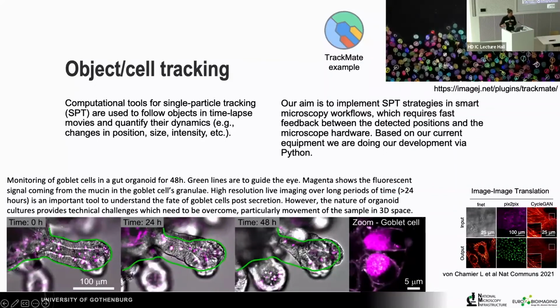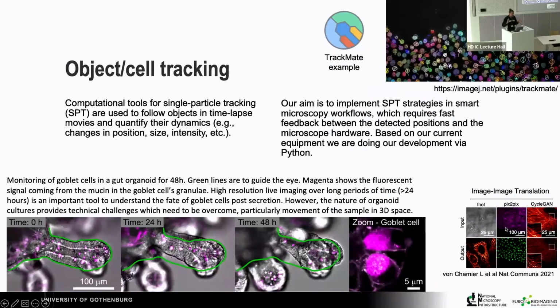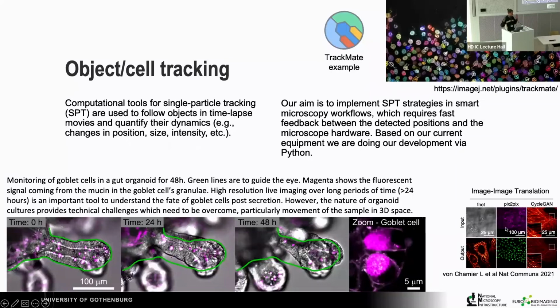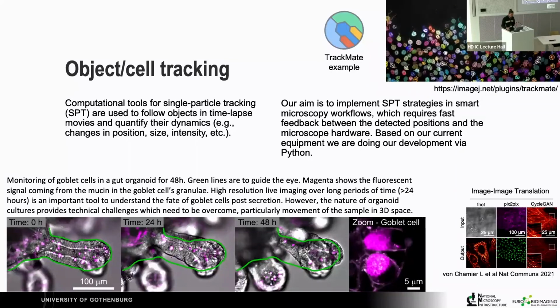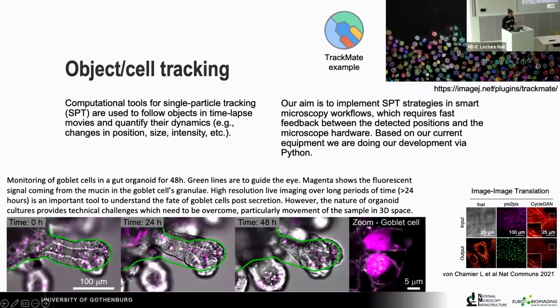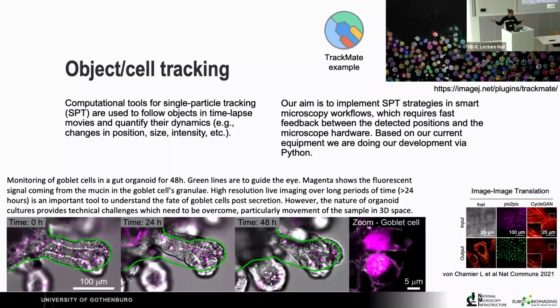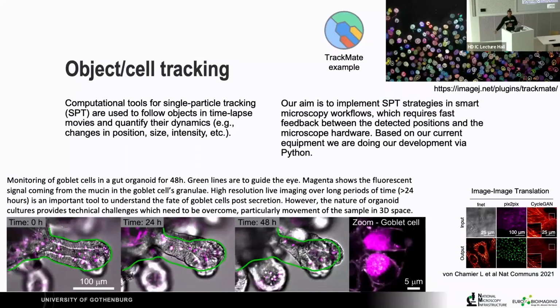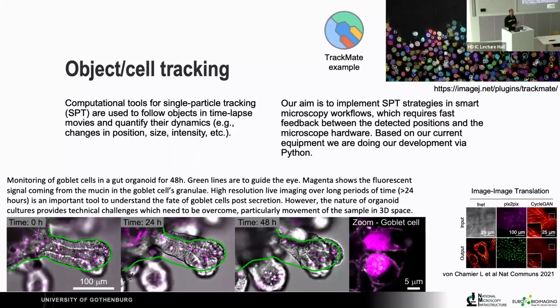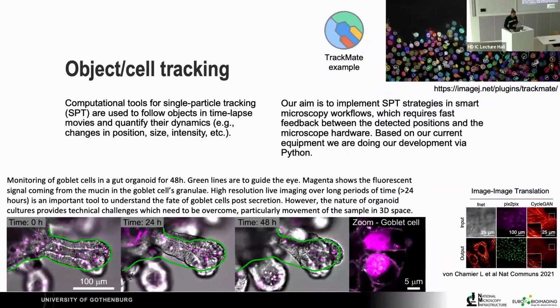Another thing is that I believe that in this field, this idea of image translation is going to be huge, right? So I know that many microscopy companies are also offering this now in the image analysis packages, but in principle, this should allow us to also follow live cells for extended periods of time, because now we should decrease phototoxicity if we can translate, for example, a fluorescence field into transmission image into what should be the fluorescence field, right?